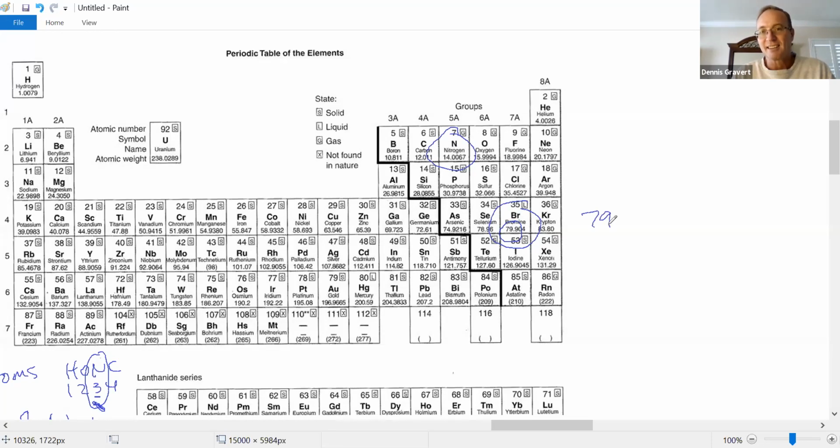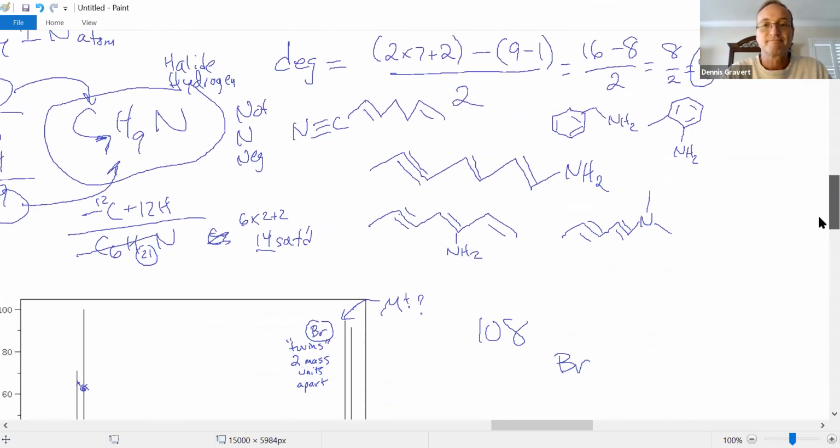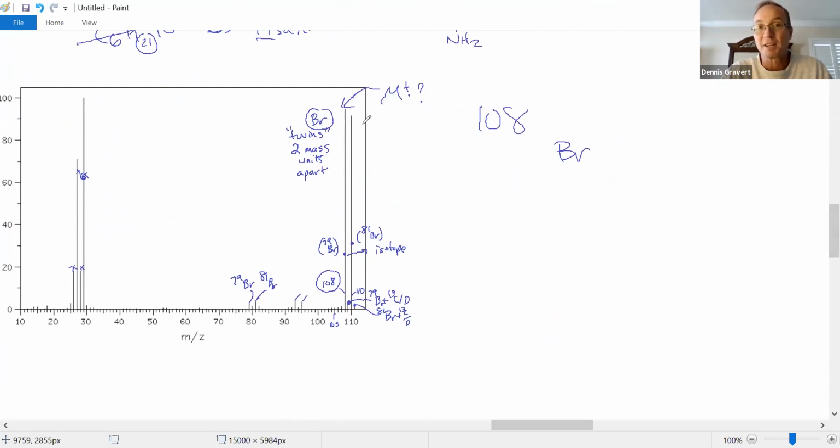It's 79 and 81. They twin that up to the average of 80. Actually 79.904. So bromine you have to know. The isotopes are 79 and 81. So only take the first part, the 79, for bromine. And you know it's bromine because of the twin peaks. So take away 79 mass units.